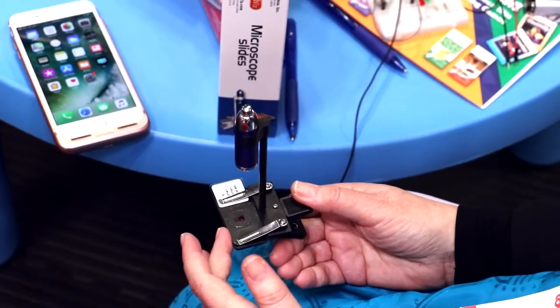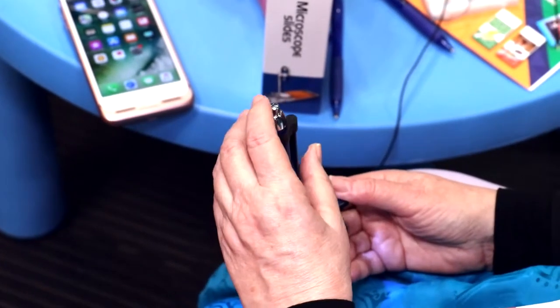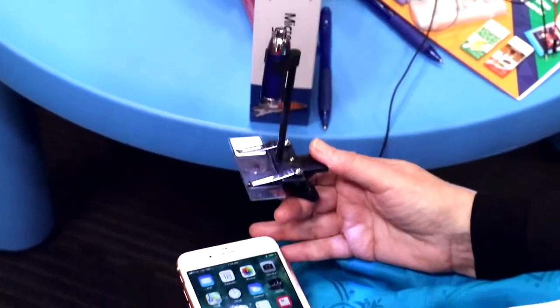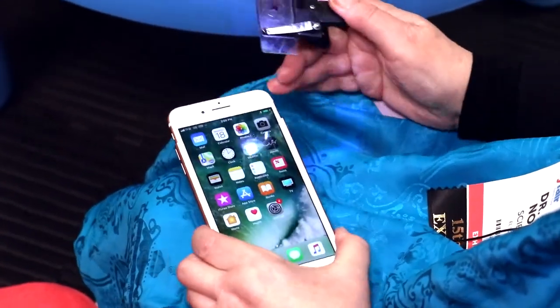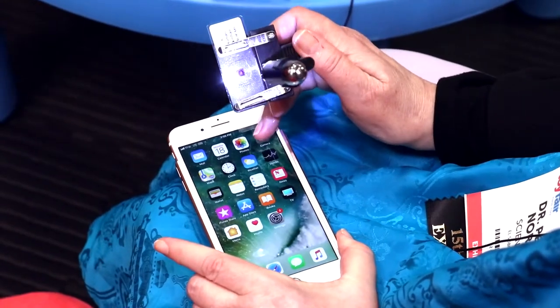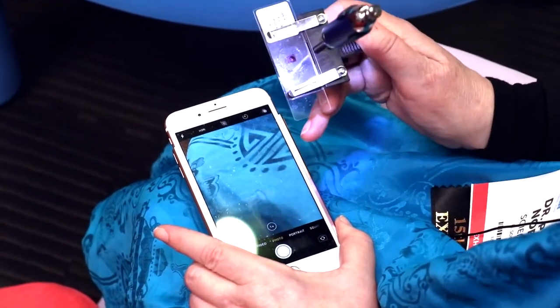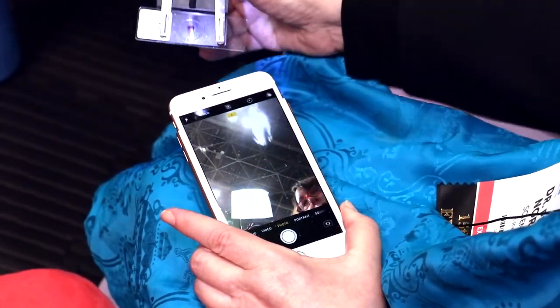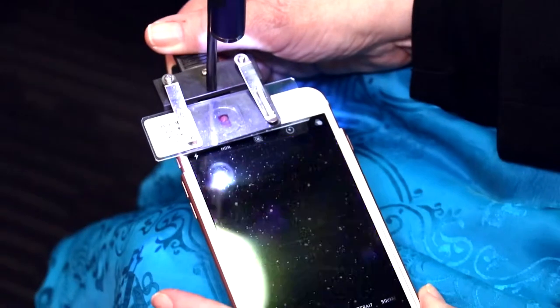After positioning the slide, all you do is turn on the light. It's really important to turn on the light — if you don't, it's not going to work. Next, you just take a cell phone or a tablet. There's no special software required. You simply turn on the camera app. I'm going to go into selfie mode, and then slide the microscope over the lens of the camera in selfie mode.